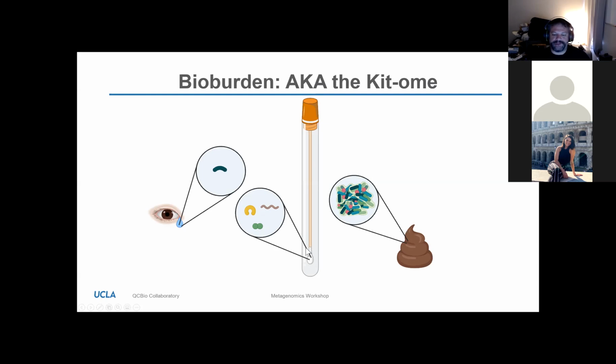So especially if I do a lot of characterization, you need to run a sample that is just testing for basically bioburden, which is to say that you run something through with basically nothing on it, just exposure to air. And I can probably detect these and separate them from the stool microbiome, but realistically, these are going to be such a tiny contributor, they're just going to show up as something extremely rare and probably not important.